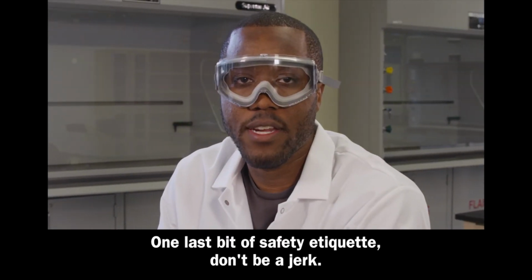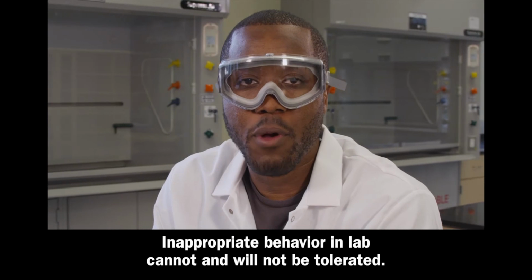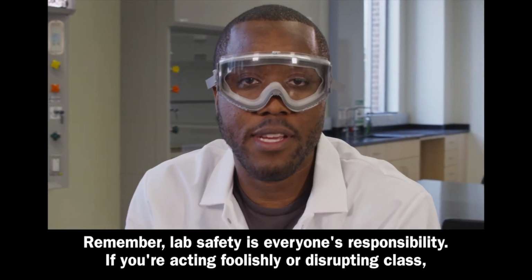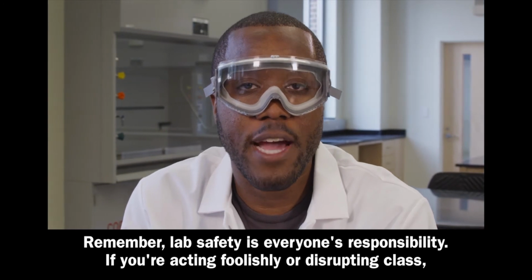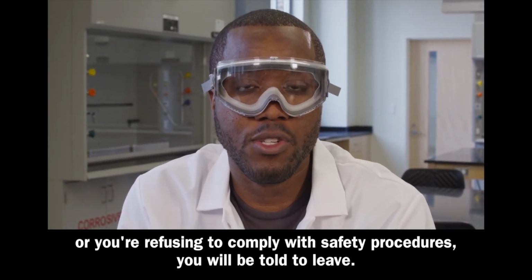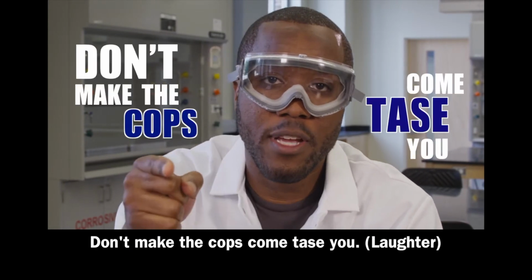One last bit of safety etiquette, don't be a jerk. Inappropriate behavior in lab cannot and will not be tolerated. Remember, lab safety is everyone's responsibility. If you're acting foolishly or disrupting class, or you're refusing to comply with safety procedures, you'll be told to leave. Don't make the cops come tase you.